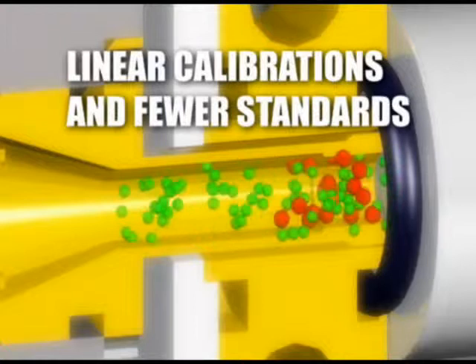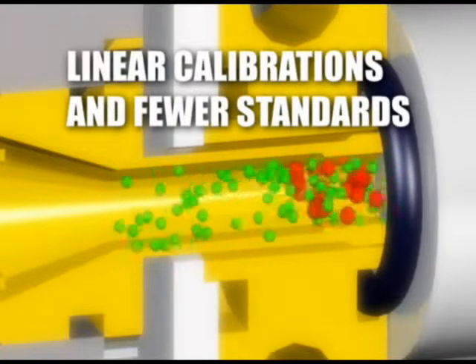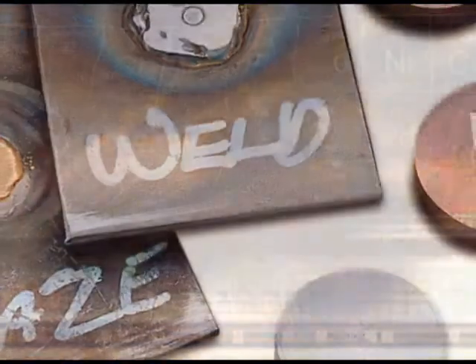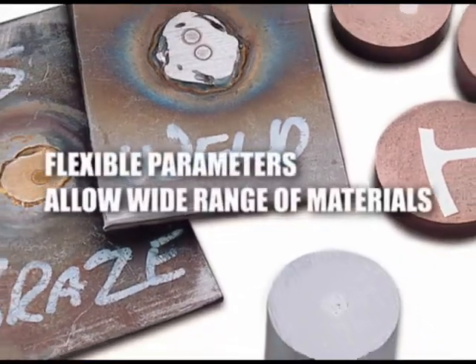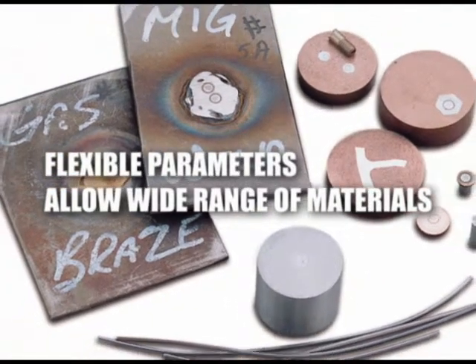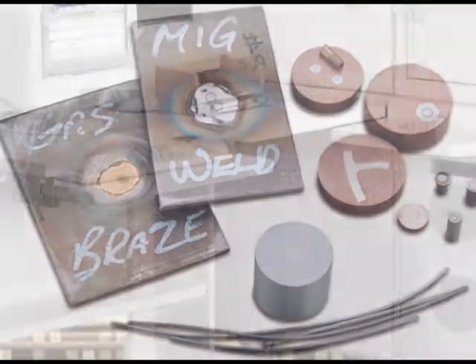The sputtering characteristics of glow discharge with the resulting linear spectral output allow a lower number of standards to be used compared to other excitation methods. The flexibility of the GDS500 analysis parameters makes it ideal for a wide range of metallic and conductive non-ferrous materials, including brass and aluminum.